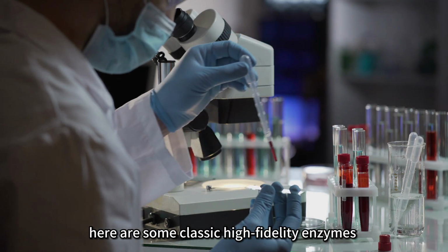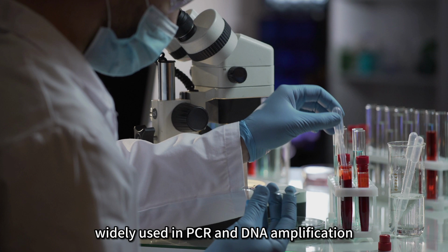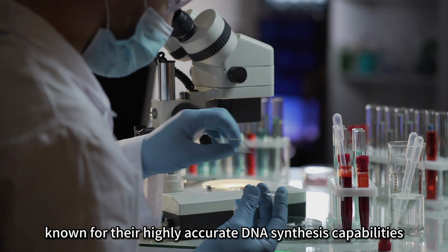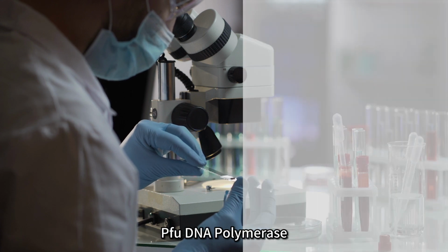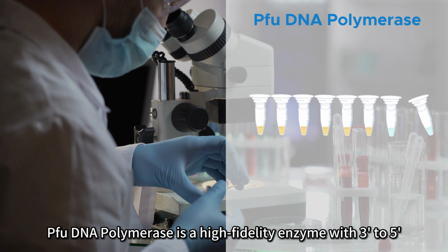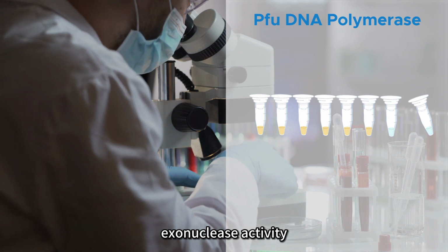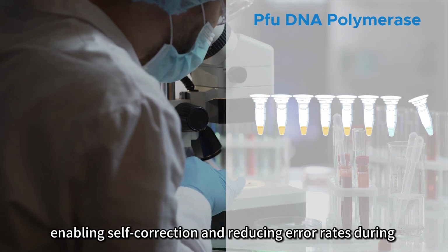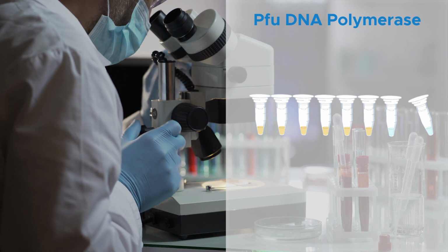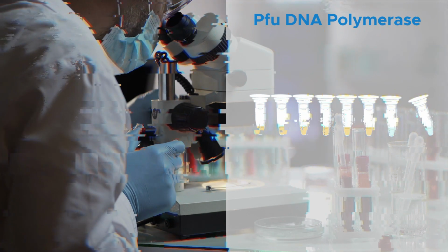Here are some classic high-fidelity enzymes widely used in PCR and DNA amplification, known for their highly accurate DNA synthesis capabilities. Pfu DNA polymerase. Pfu DNA polymerase is a high-fidelity enzyme with 3' to 5' exonuclease activity, enabling self-correction and reducing error rates during PCR. It is widely used in gene cloning and DNA sequencing.